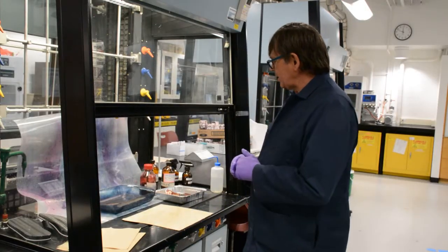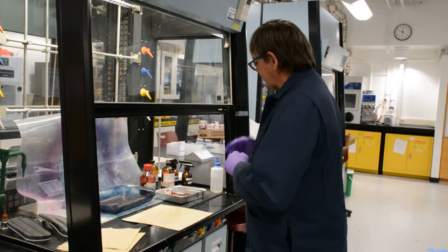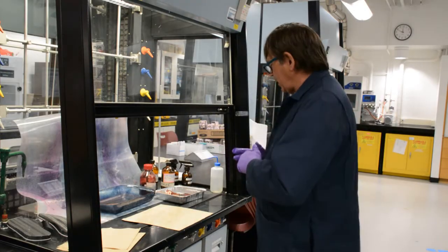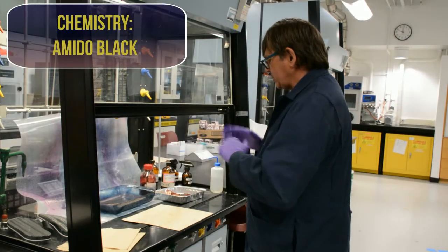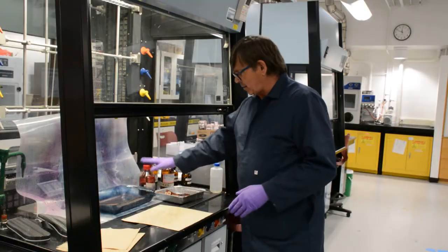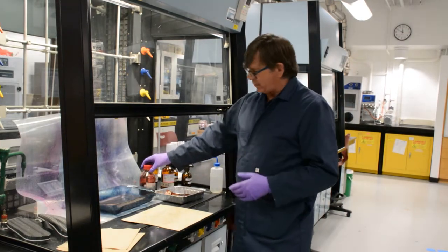Okay, so we've just shown the Hungarian red as an option as a blood enhancer, and there are several options available. So we're going to demonstrate another option at this point, which is Amido Black. We're going to go through the same steps that we did with the Hungarian red, as far as taking our blood, making a bath of the blood, and then wiping that blood onto a shoe impression.